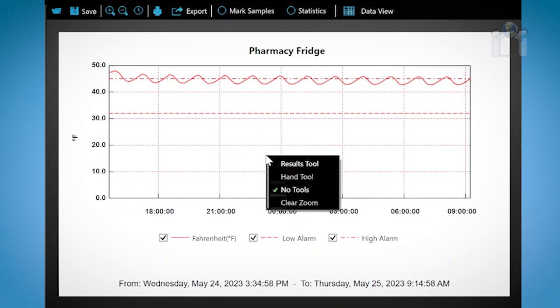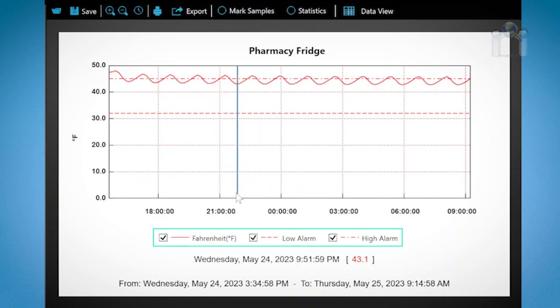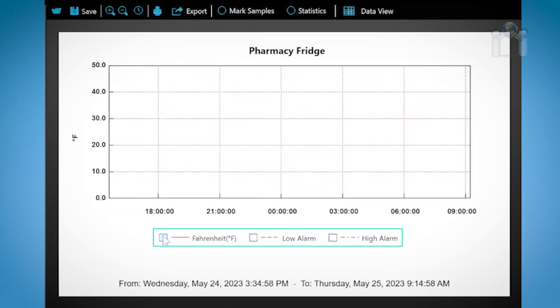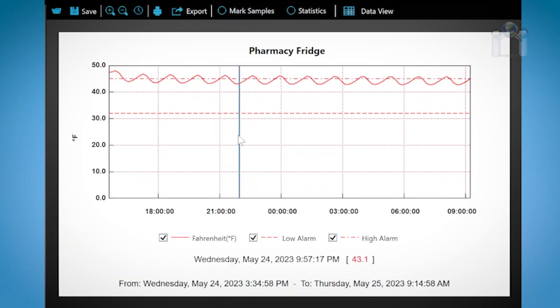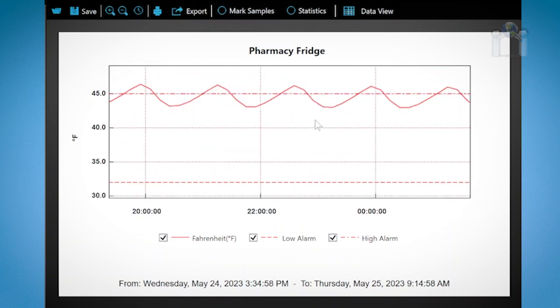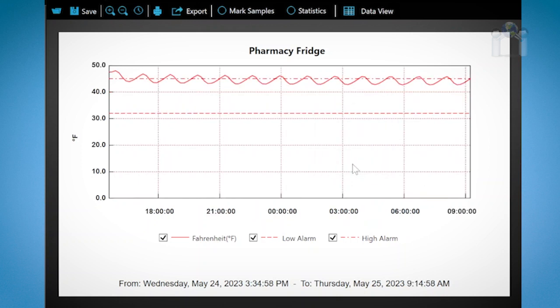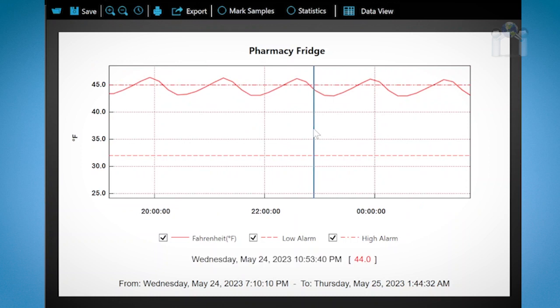Below the graph you will see three graph legends with a checkbox: Fahrenheit, low alarm, and high alarm. If you uncheck the box next to the name on the legend that line will be removed from the graph. Of course if you put a check back in the box the line will return. You can select a range to close in on by creating a box around a selected area. You can return to normal viewing by right-clicking on the mouse and select clear zoom. I can also click on the magnifying glass with the minus sign in it. There are also other viewing options that will help you read the details from the log file.